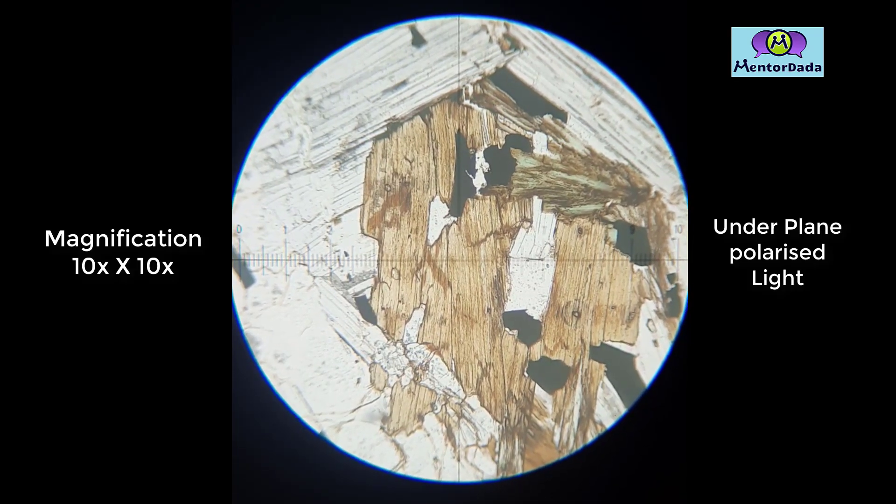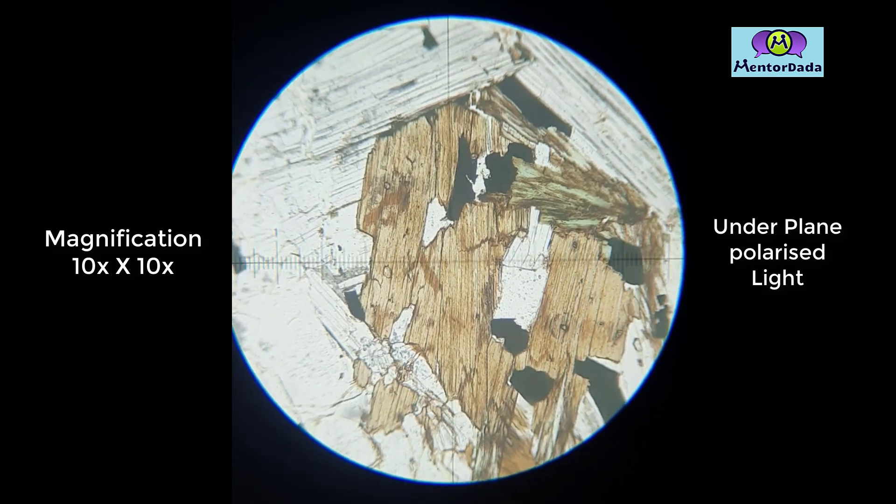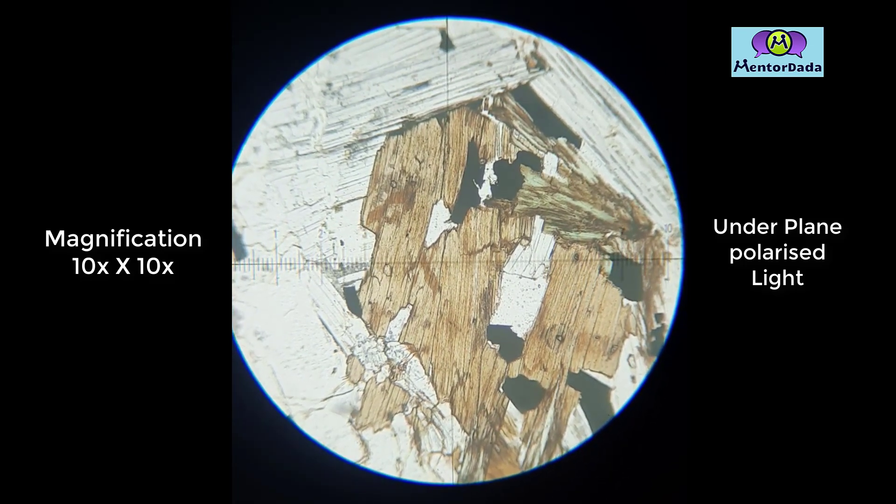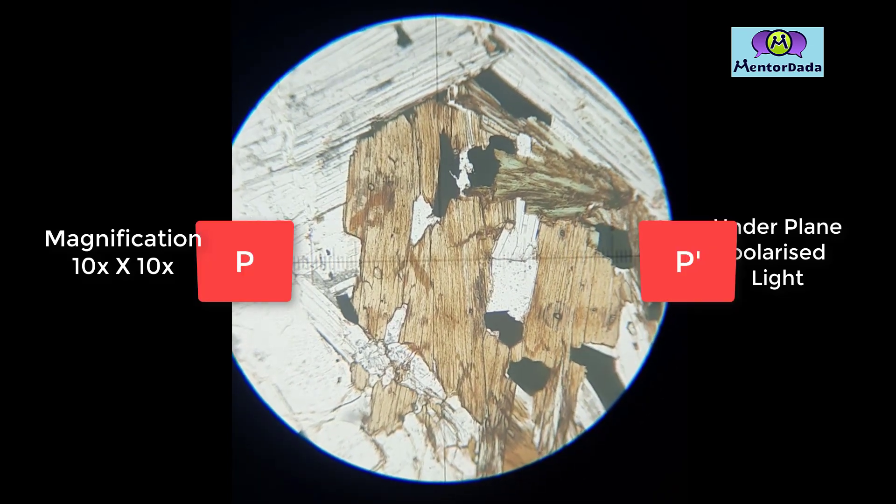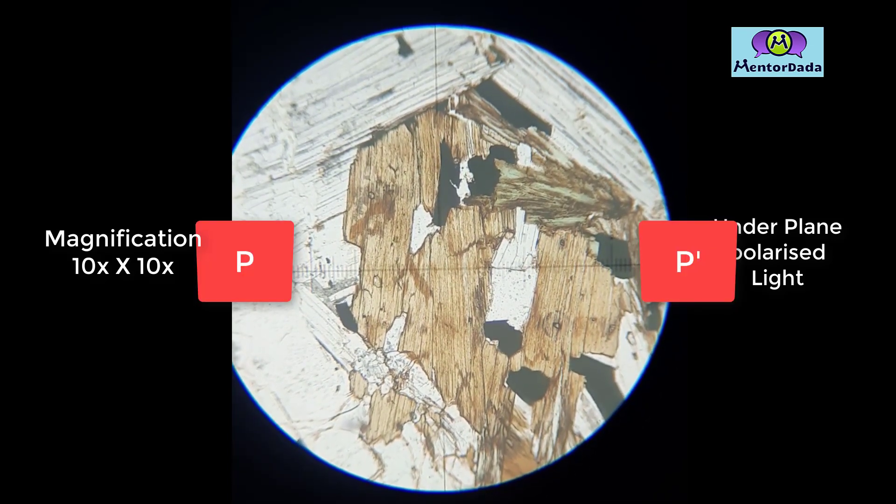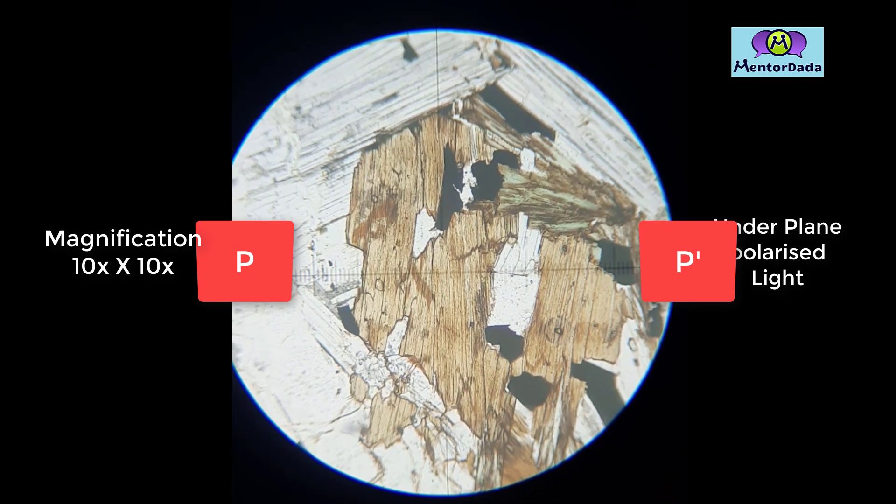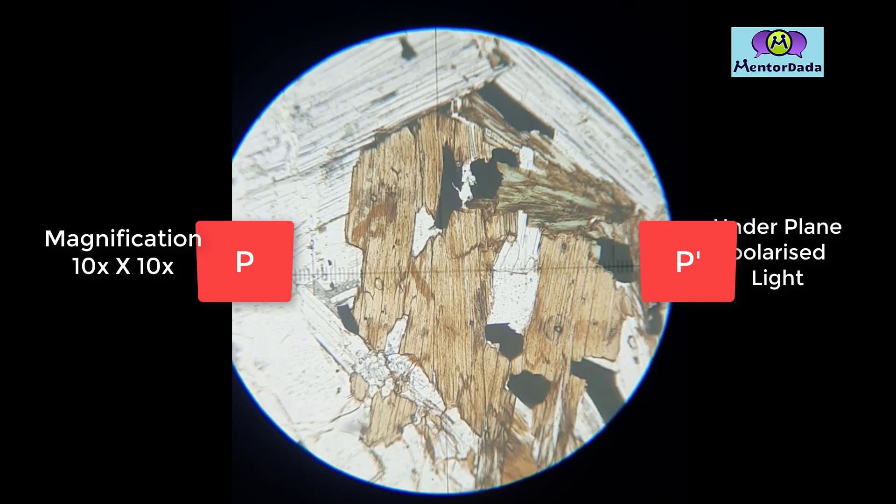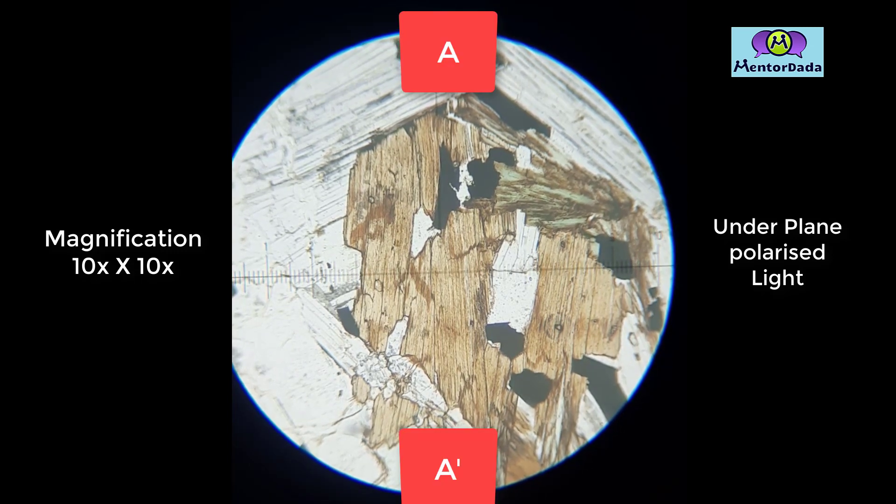Now here we are observing the mineral under plane polarized light. The analyzer is not yet inserted. While you are observing this mineral, take into account that the vibration direction of the polarizer, that is p p dash, is in the left-right direction, while the analyzer when it is inserted is in the up-down direction.